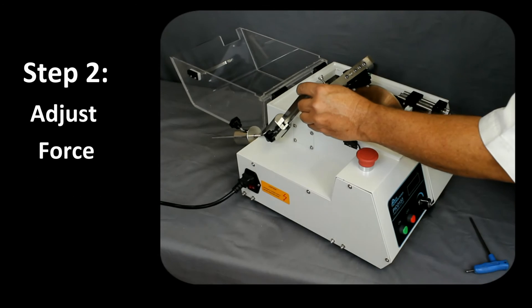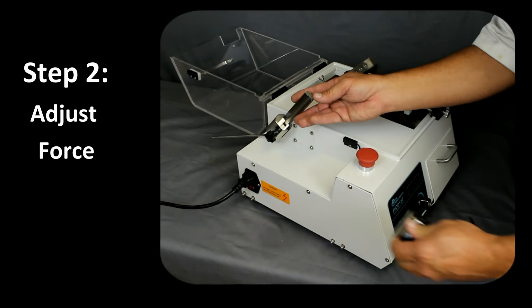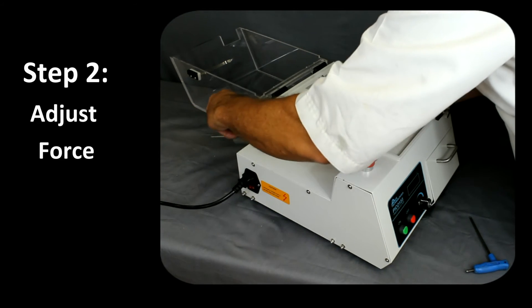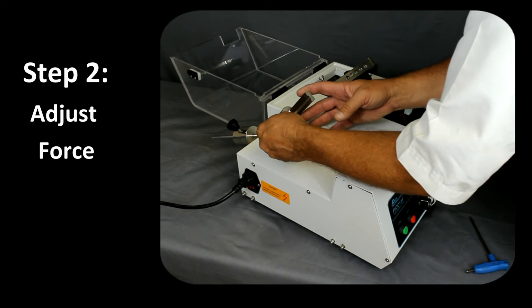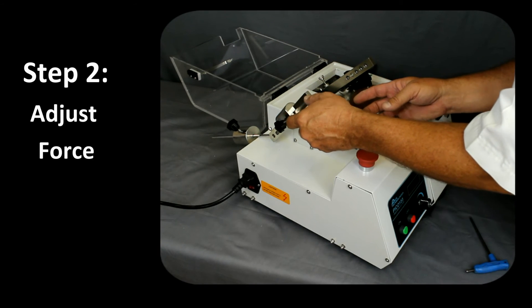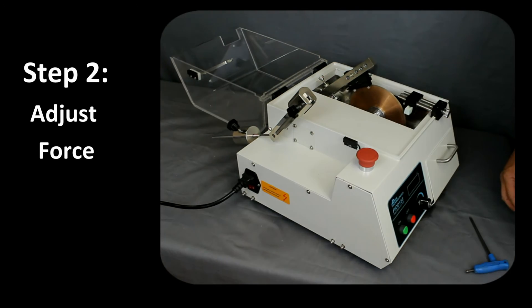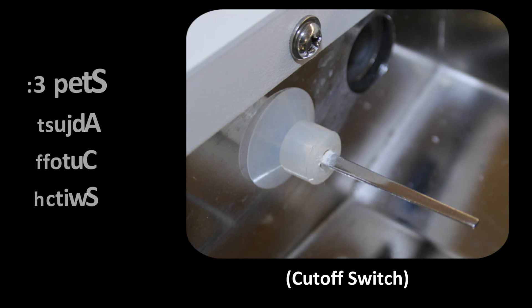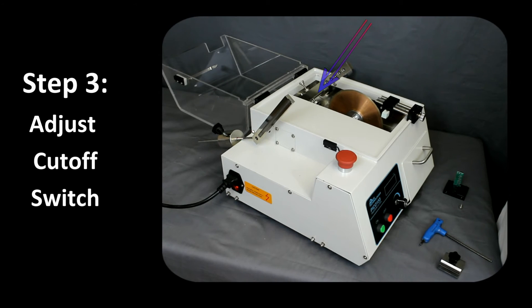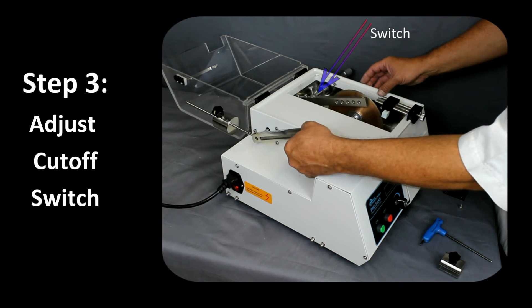The second step is to set the cutting force by adjusting the variable weight on the loading arm. Before starting the cut, there is an automatic cut-off switch that can be adjusted inside the machine. With this properly adjusted, the Pico 155 motor will automatically stop after the switch is engaged, thus making the cutting operation a hands-free process.